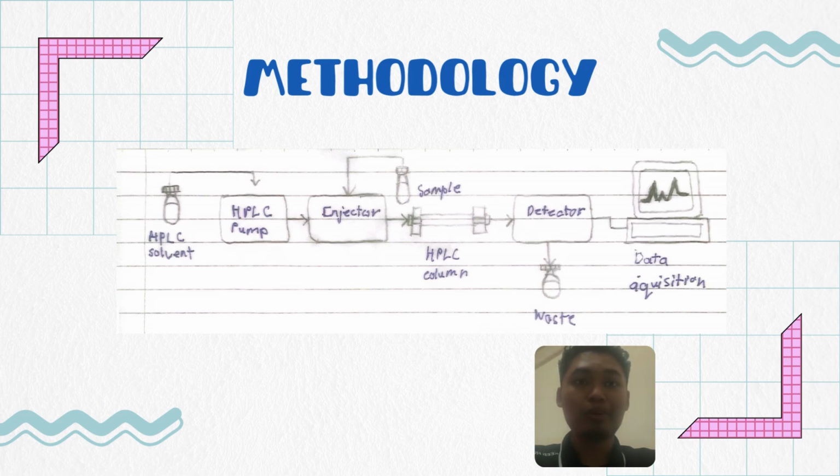The separated components pass through the UV detector. Set the detector wavelength at 275 nanometer for caffeine. The detector records signal intensities corresponding to analyte concentrations.